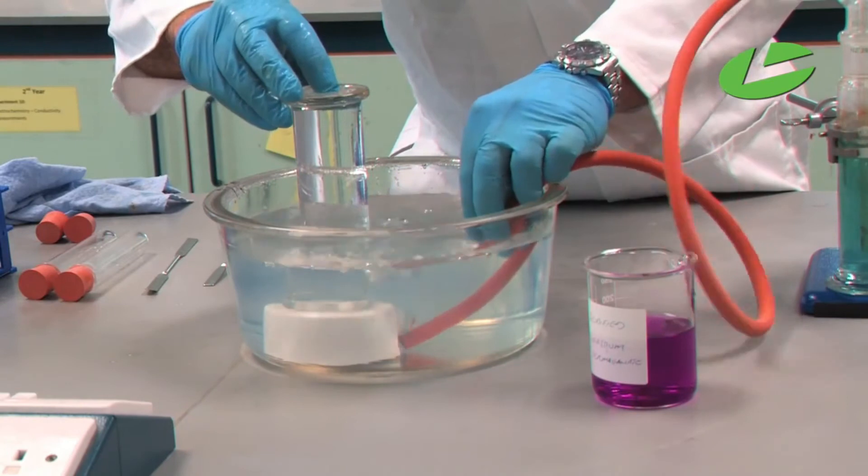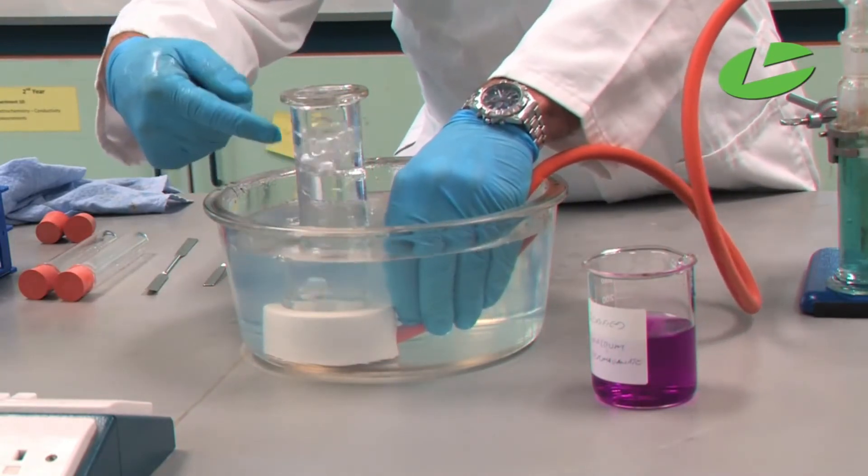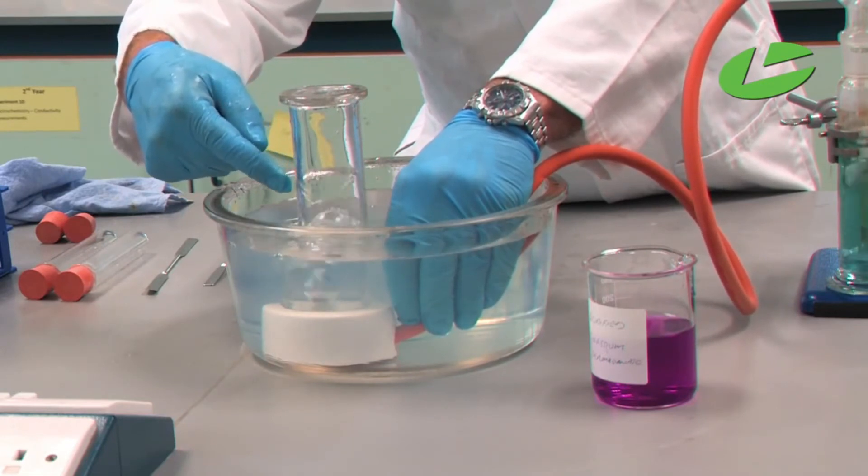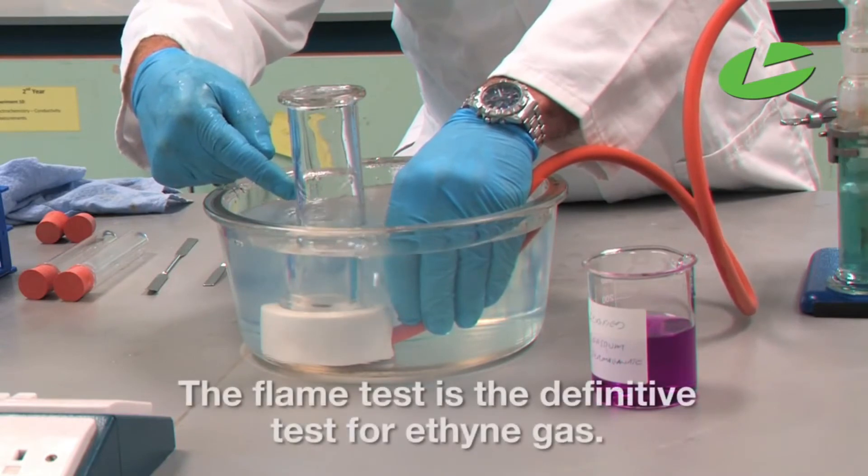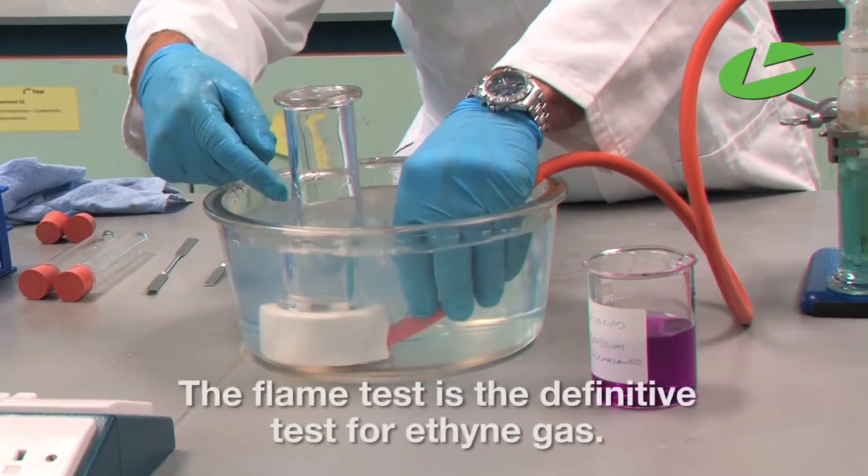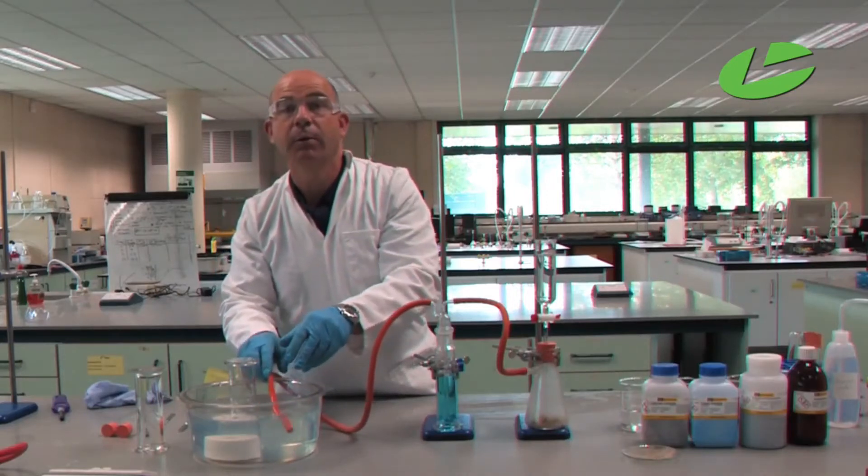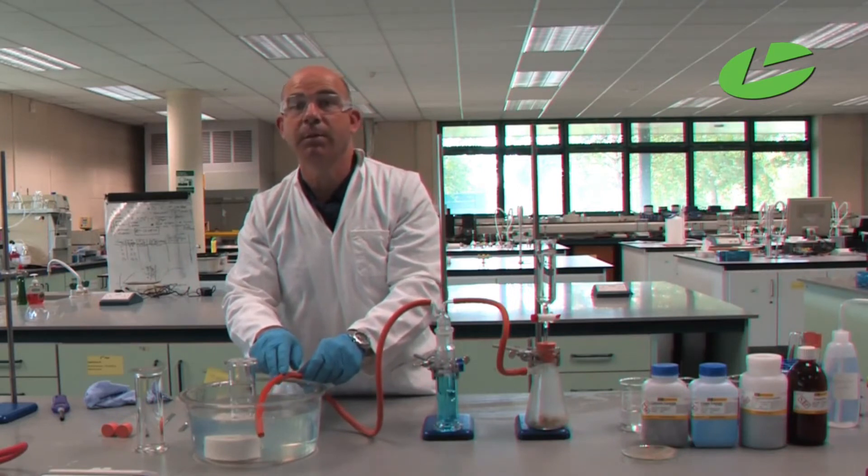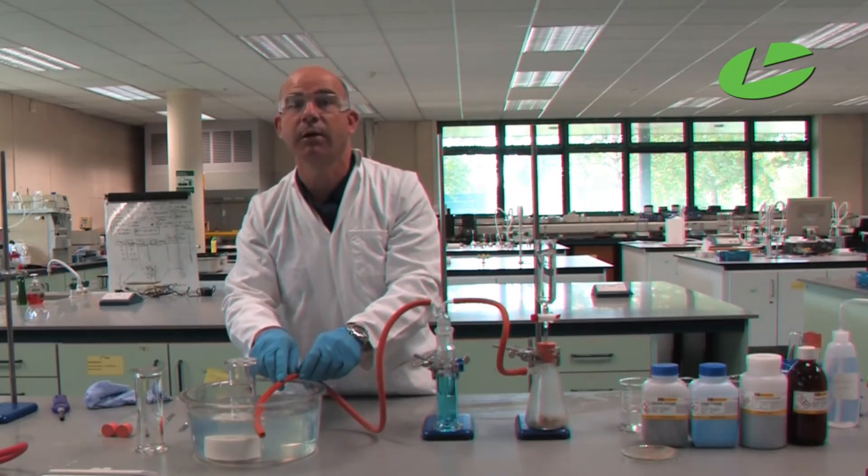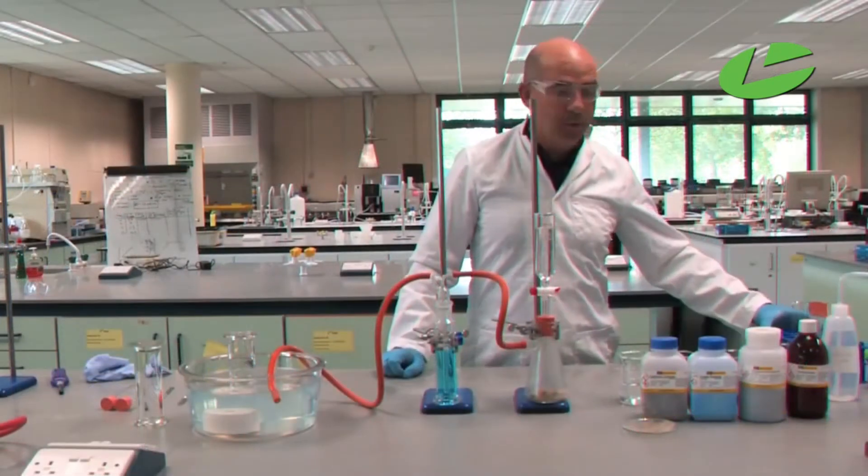Now that the displaced air is gone, collect the ethyne gas for the flame test. Place the tube into the beehive and watch the bubbles come up, displacing the water downwards. Once the glass jar is full of ethyne gas, we can do the flame test, which is the definitive test to see whether we've got ethyne present. Before the flame test, I'm going to demonstrate the check to see whether we've got an unsaturated compound. This checks for unsaturation, not specifically for ethyne - the flame test is for ethyne.